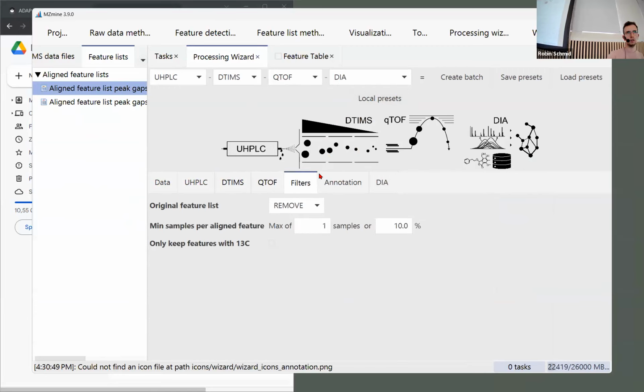As we usually say, the data independent features are new in MZmine. There's software that has been specifically developed for it, but we have something. If you test it out and let us know in the end if you had good experiences or bad experiences with it, that would be great. But you can basically process any vendor's IMS files. Yeah. And yeah, if you do, as Robin said, want to process timsTOF files, then we recommend to use the actual raw data.